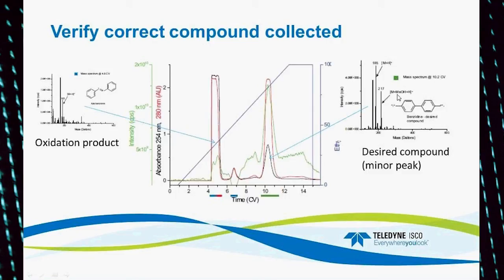And so you can see here again, it formed an M+1 here, and it formed an M+1 plus methanol adduct here. Since we use methanol as a carrier, we see that's pretty common practice with our electrospray system.